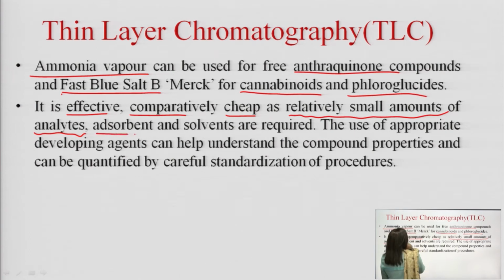Okay. Next, adsorbents and solvent requirements are also less than for many of the sophisticated instruments that we are using for analysis.